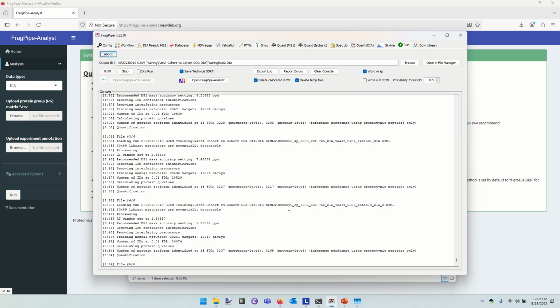Okay. Well, we've done two thirds of the quantitations. We're closing in on the end. Soon we will have our report PG matrix.